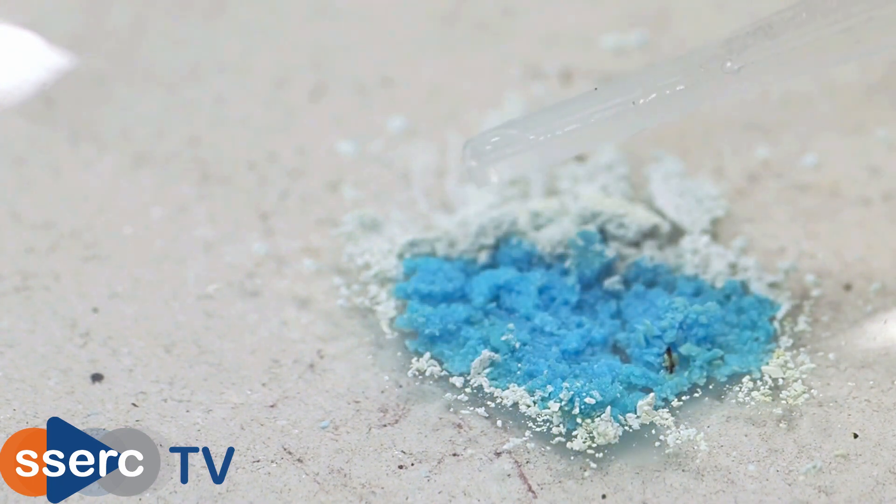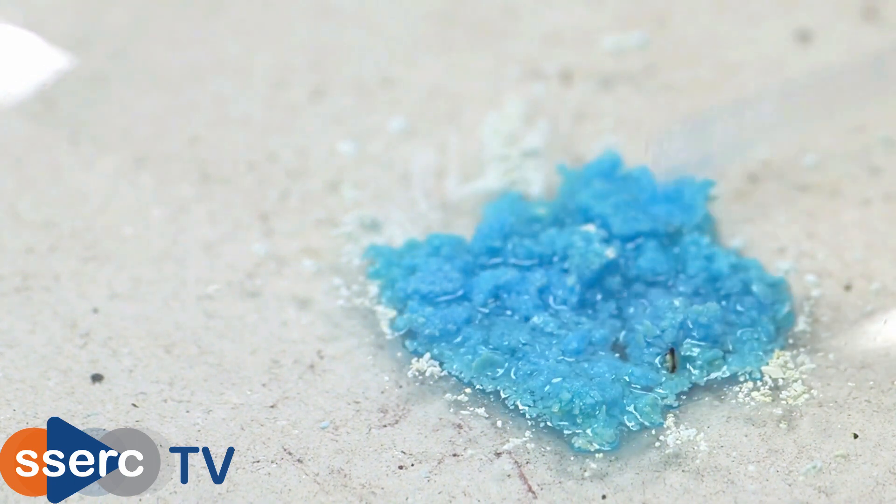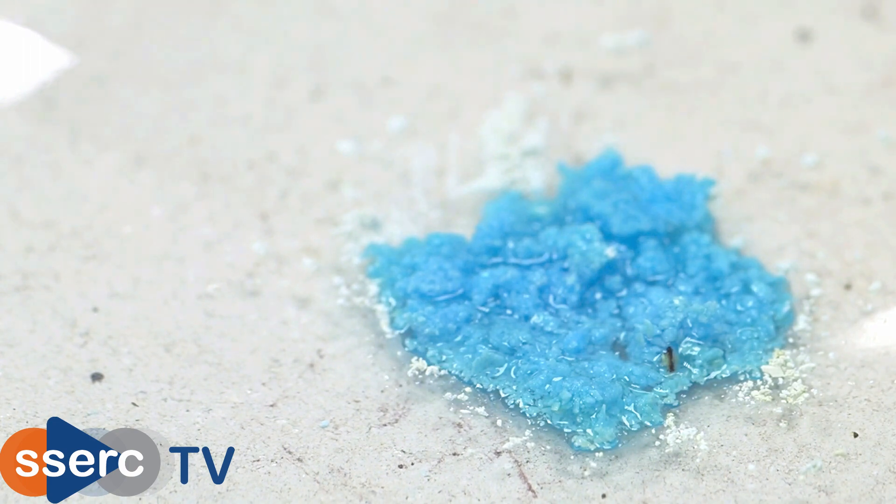You can easily see the return of the blue in its hydrated state. You may also be able to see a small amount of water vapour coming off, as the process is quite exothermic.